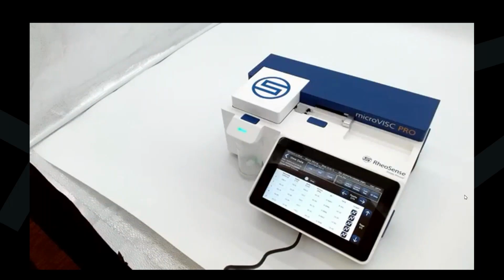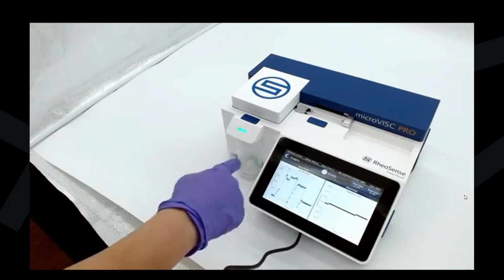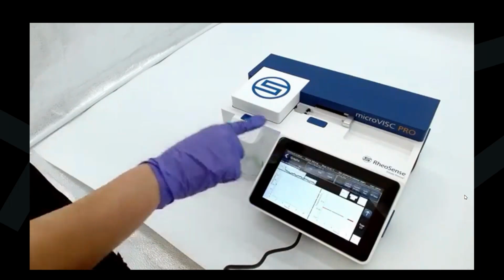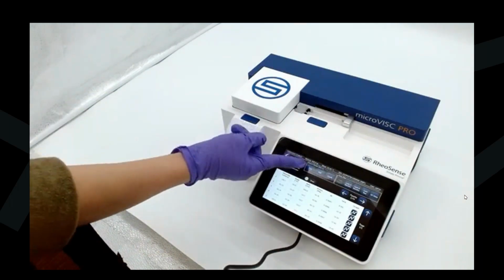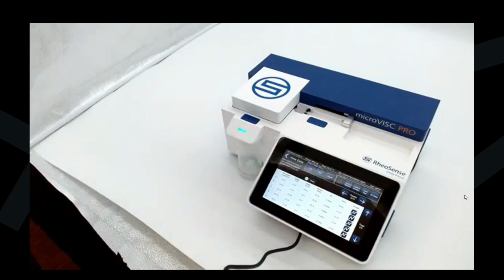You also have access to the graphs that you saw earlier. So you can even tap on those icons and it'll show you all of that data. So all this data is accessible to you. You can export it to your USB, you can export the CSV, the PDF document, or there's another file type that you can export.